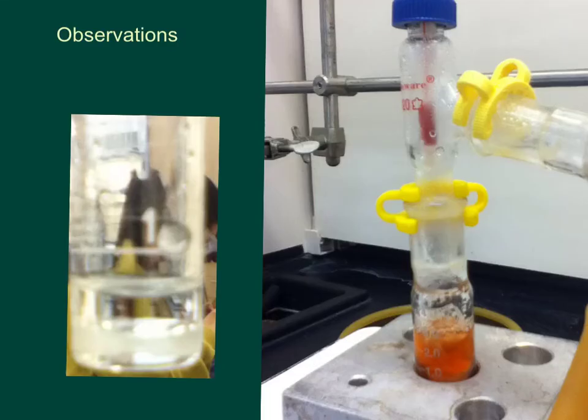So here are some observations we saw. Our sample turned a bright orange which ended up getting darker and darker as time went by and then losing that color. And here we have a picture of the receiver. The 0.5, maybe 0.6 here is how much the student got.